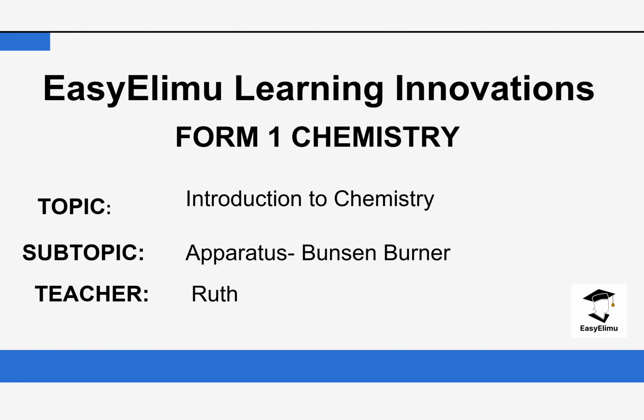My name is Ruth, and today we are going to be discussing an Introduction to Chemistry. And today we are going to be looking at the non-luminous flame.